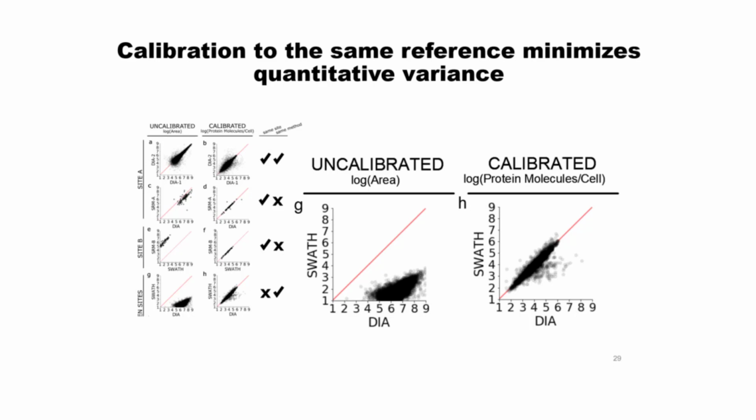It's not something that can be a digested sample. It's got to be something that goes through your sample preparation with you, because there is a lot of variation that can occur from one batch to another, and one lot of trypsin versus another lot of trypsin. So it is something that's got to get prepped with your samples at the same time.